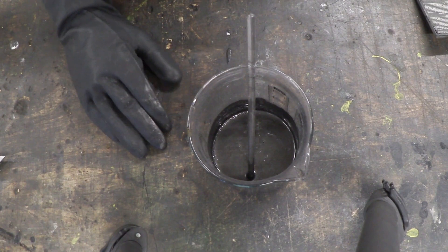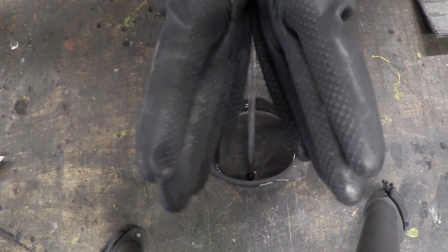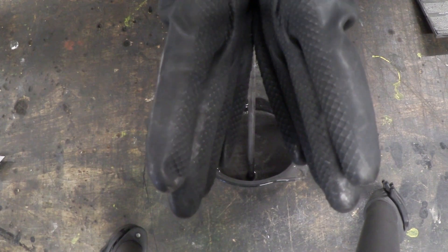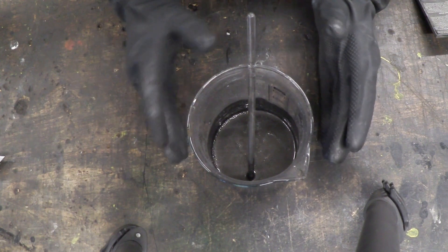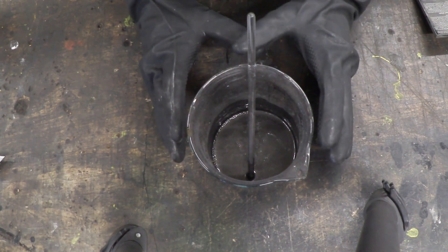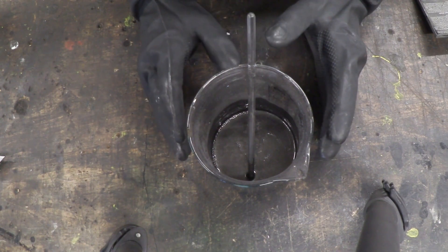And the way we help it along is by oxidizing the edges. Now, remember that graphite is in layers like this. If we oxidize the edges, those layers at the edges get spread further apart, so it can intercalate much more easily. And it does, but it's extremely rapid. So when you've got this ready, the next thing you need to do is chill it — you need to chill it down to about zero degrees.